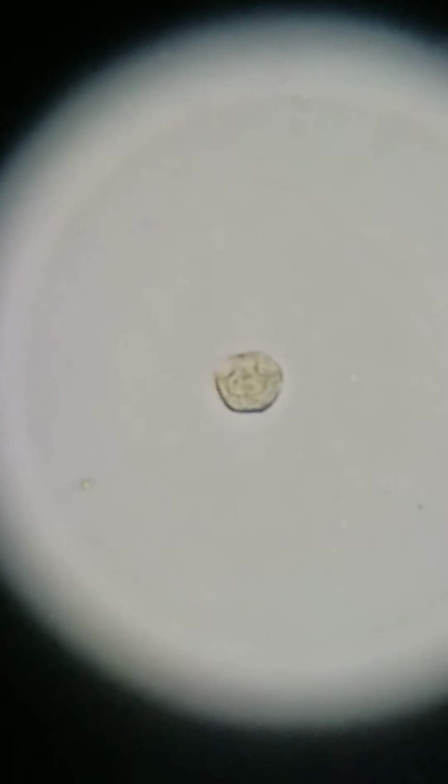Okay, let's try. I'm back on the scope, so I'm not looking at my phone. Ooh, look at that. Looks nice on my phone. That looks like a transitional epithelial cell. That's not pathologic, okay? Isn't it gorgeous?